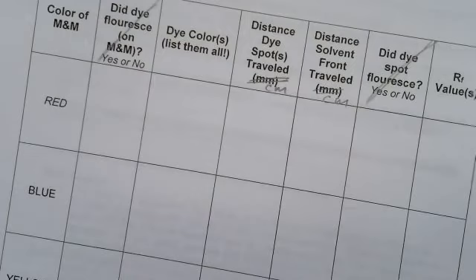The next part, on the back of the M&M directions, are the marker and pens. You are just going to follow these directions. Okay? Now, here is the station to prepare the marker and pen inks. We are going to use the circular chromatography or filter paper. I already have pencils here and everything you need.